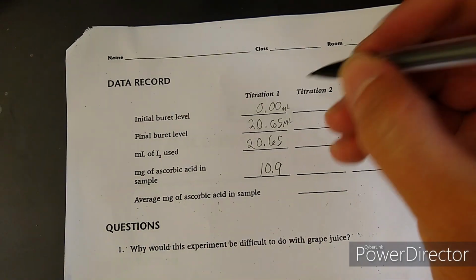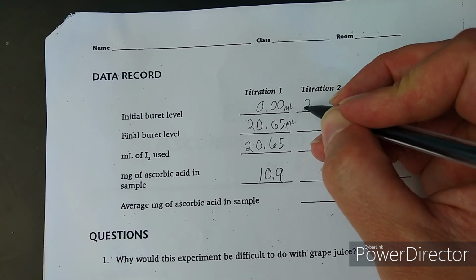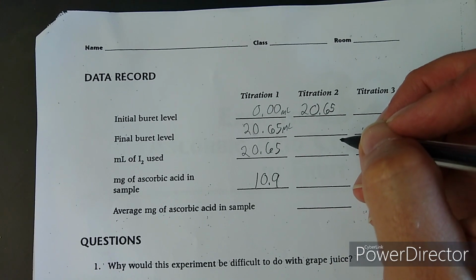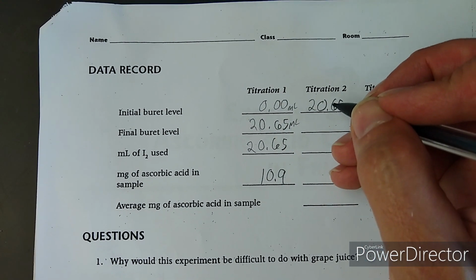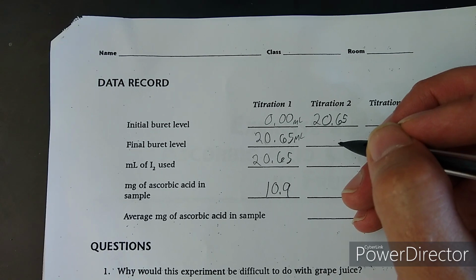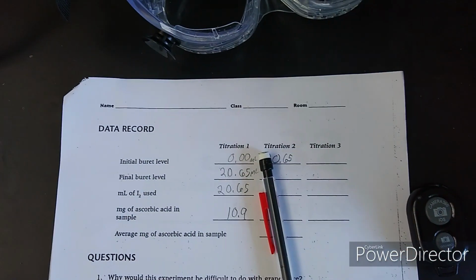Now I'm not going to refill the burette until the 3rd trial, so our 2nd trial is going to initially start at 20.65, and then final burette level should be around 41, since it should take about the same amount to do the 2nd titration, because these 2 solutions were mixed, intending them to be identical. So let's put that to the test.